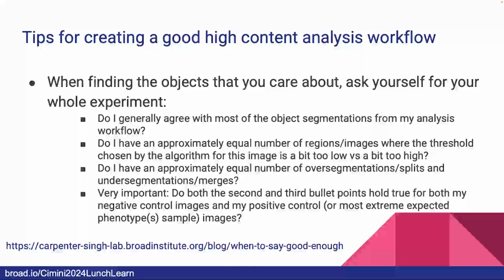I can't tell you how heartbreaking it is to spend months trying to chase down what turned out to be a segmentation error in one of your conditions. Actually, I can tell you because I did it in grad school. It's not fun when you then have to go to your boss and be like, actually, that biology wasn't real. My analysis was just bad. It's not a fun day. Avoid that day. Check this first.